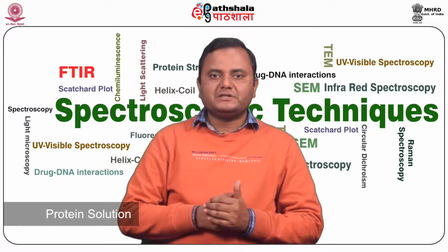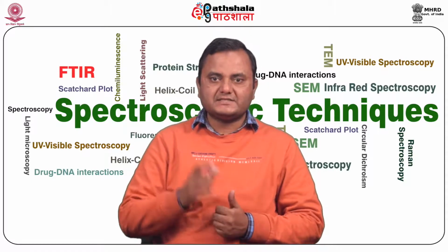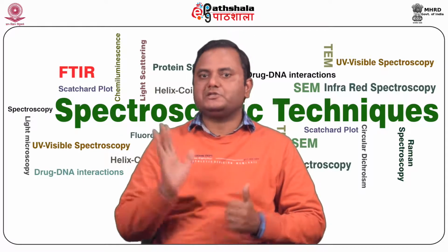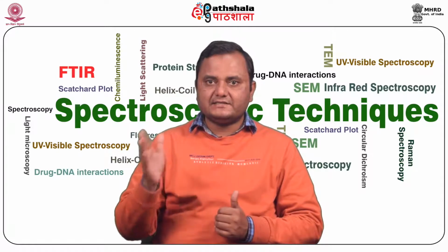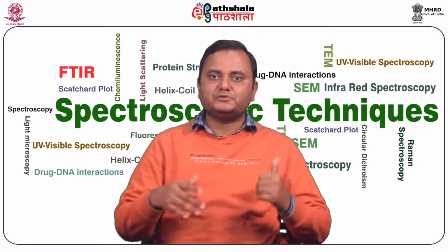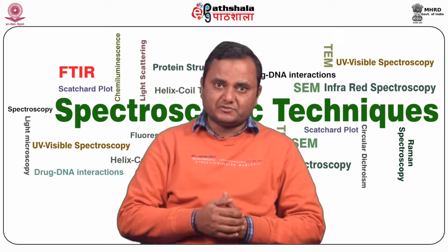About the protein solution, it follows from the above that the protein solution should contain only the chemicals necessary to maintain its structure and stability, at the lowest concentration possible. You must avoid any chemical that is unnecessary for protein stability and solubility. The protein itself should be as pure as possible, and additional protein or polypeptide will also contribute to the signal, so it should be avoided.